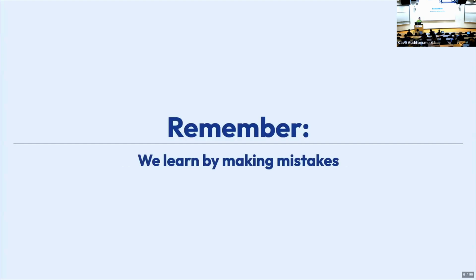I remember when I was first starting to learn image processing in cryo-EM, I was terrified of running the wrong job. I didn't know what was going on. What the hell is motion correction? When you run one of these jobs and it doesn't turn out how you expect, that's okay, right? You learn something, just like you would learn something if an experiment at the bench failed.